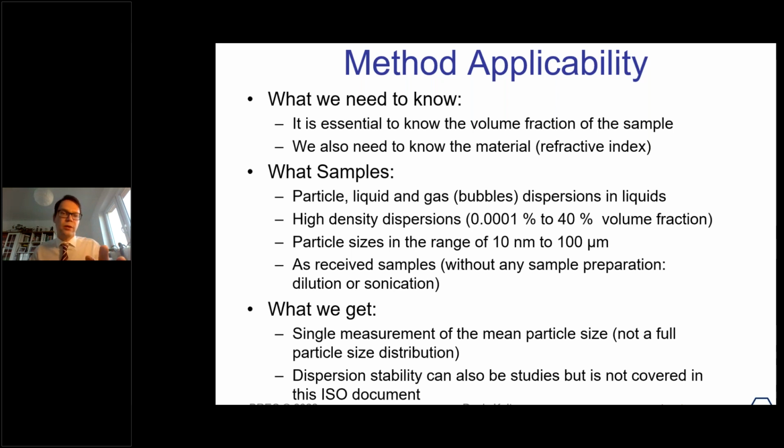you need to be aware that if your sample is not stable and it will sediment by the time you have stopped the measurement, you may have slightly misleading data. So you will have to sort of remedy that. But that's not because of the technique, that's because of your sample not being stable while measuring. Measurement is actually quite quick, as you know. It's a single point measurement. You can do several averaging runs, but single point measurements are usually quite quick.